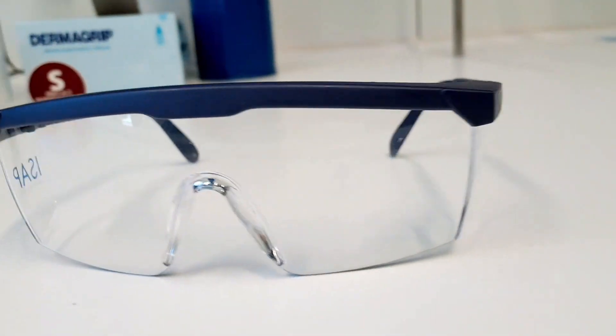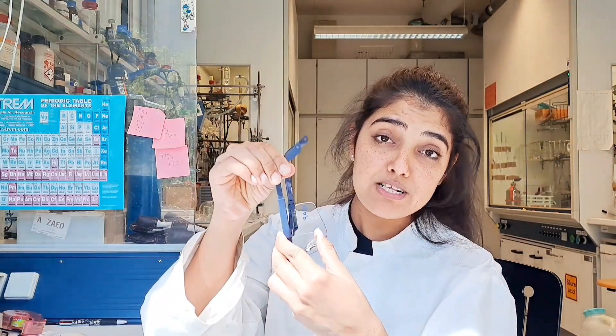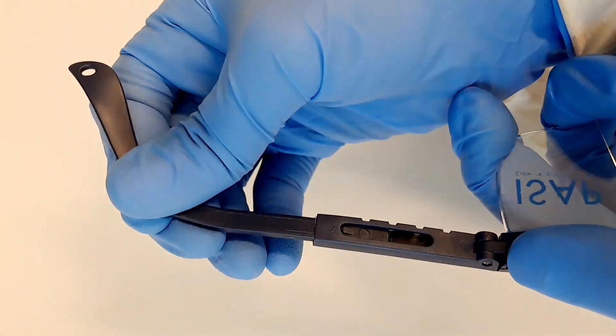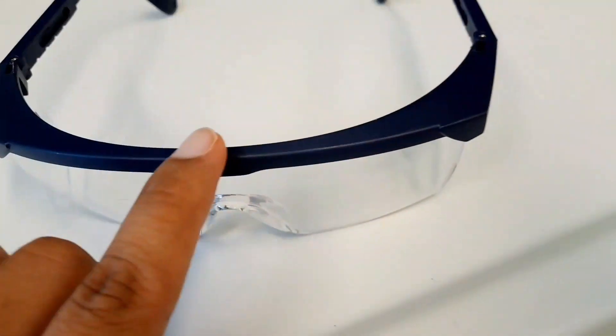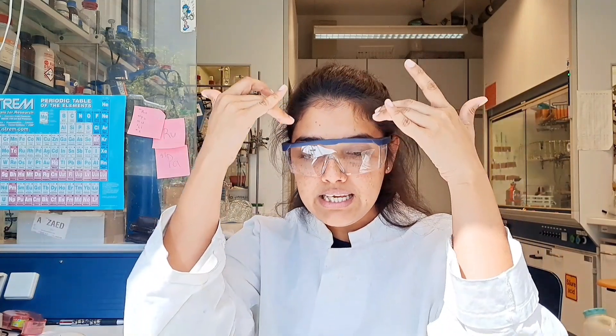Now moving toward the second pair of glasses — these are one of my favorites. In almost every video you saw me wearing these. I really like them because they have adjustable side wings you can adjust according to your head size. They also have very broad side protection and are slightly bigger in size compared to the previous ones. They have protection on top, so if you accidentally spill a chemical it won't directly enter your eyes. They have enough ventilation so they are less likely to fog up, and I use them for almost every day in my chemistry.